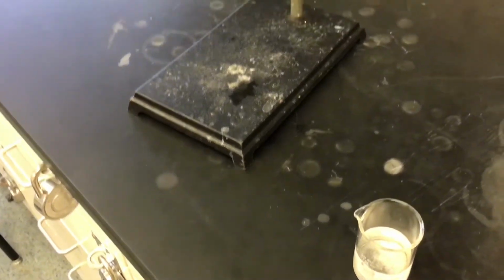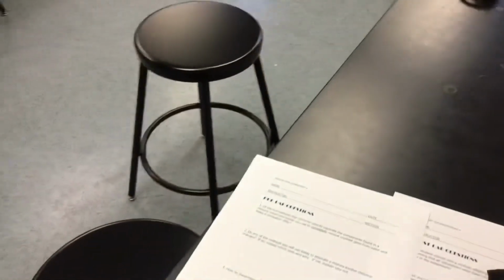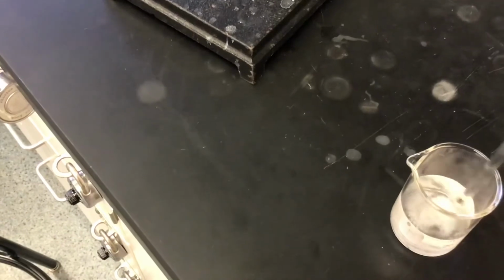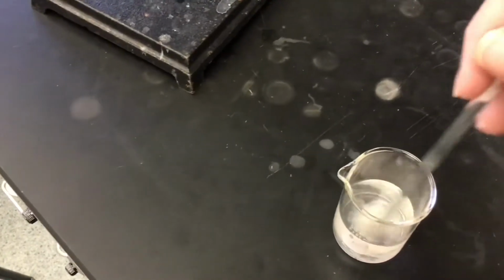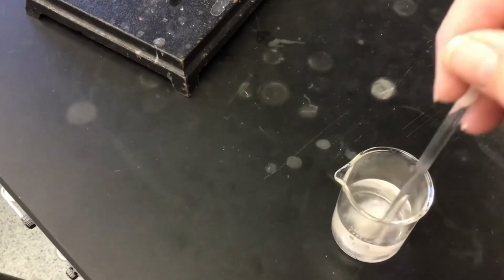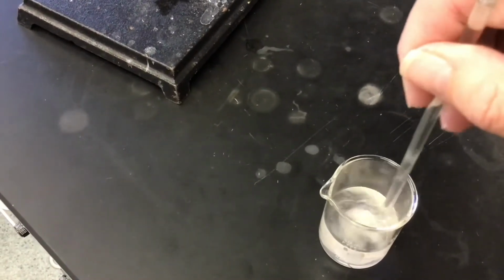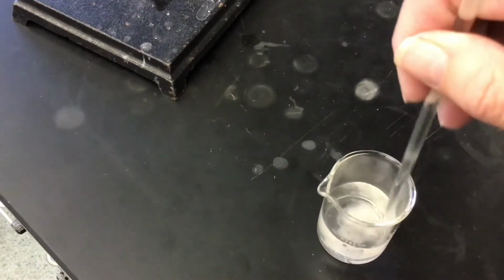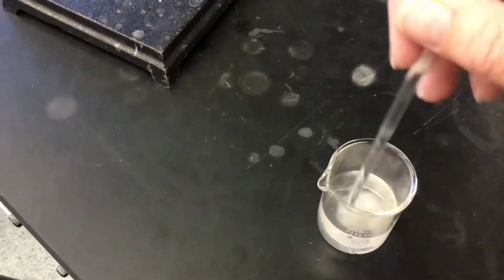Okay. And then I'm going to stir. And of course I left my stir rod on this side. Oh no, I didn't. There's my stir rod. Okay, and so I'm going to stir it. And stirring is going to help dissolve any of that salt. And then it tells you to put it on the hot plate for a moment. Get it all nice and hot, so it might dissolve some of that salt. Okay, so I'm stirring it around.